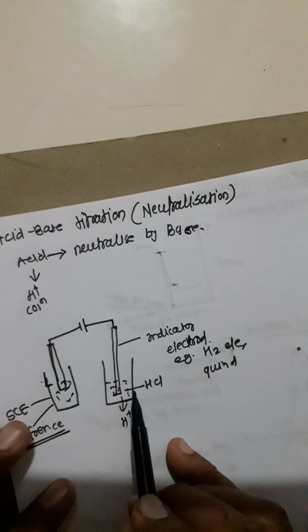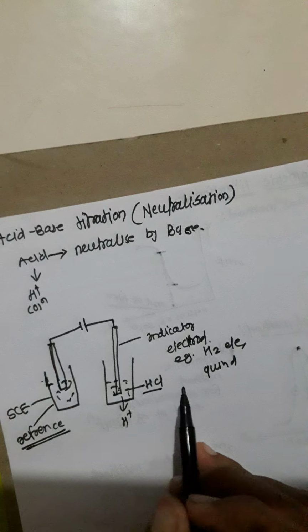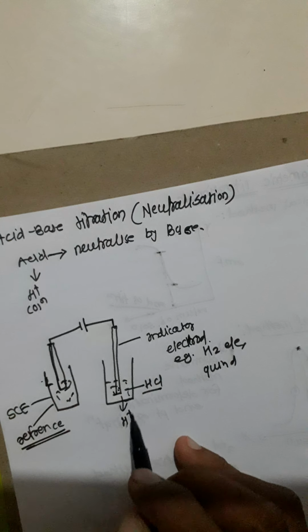Take the beaker and take the HCl solution, in which H plus ions are present.